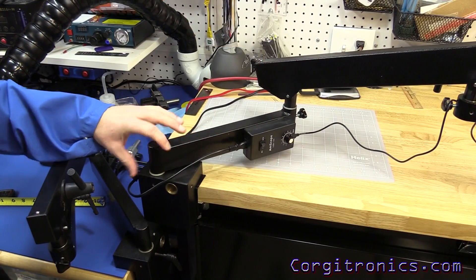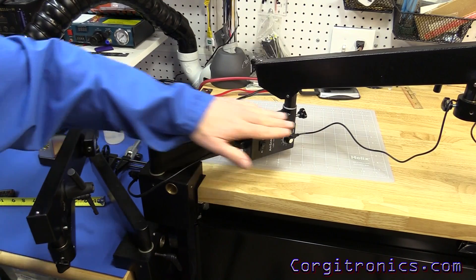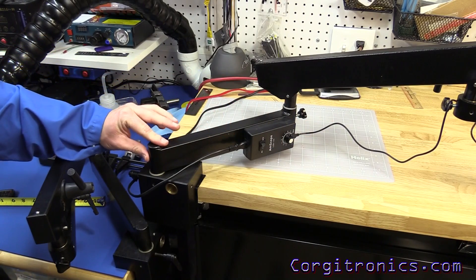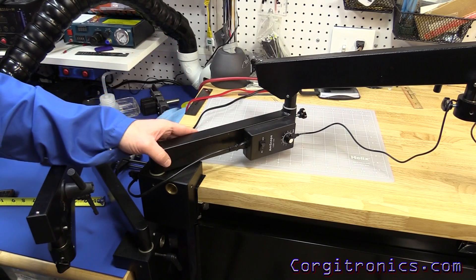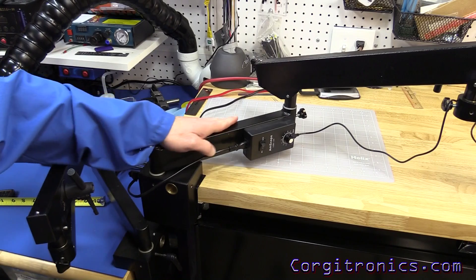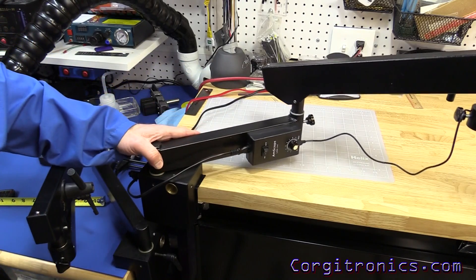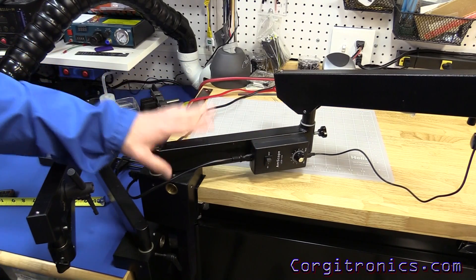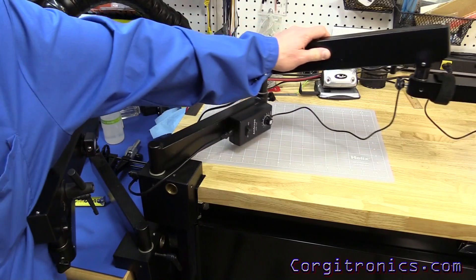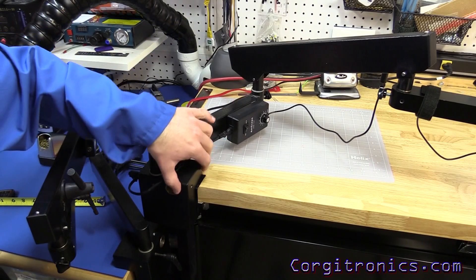As for clearance, this arm is about 15 inches from the screw head to the back of this pivot point — that works out to about 380 millimeters. So you'll need a fair bit of room if you're mounting it right at table height. You might also mount this on the corner of the table and pivot it around the work area instead of over it.